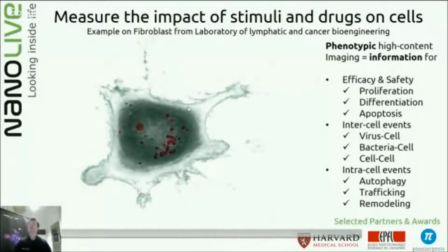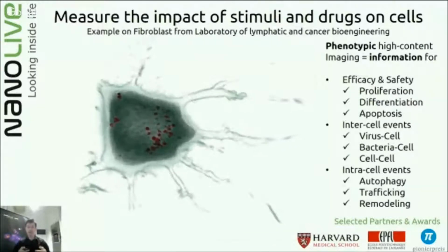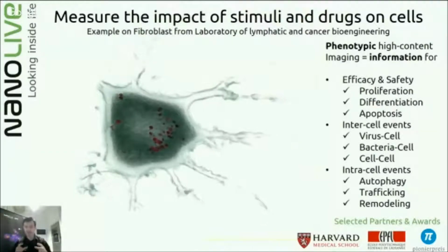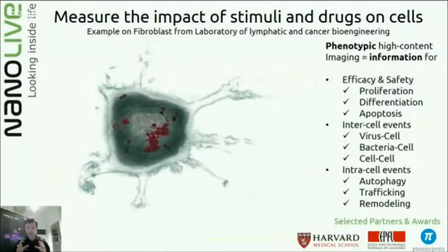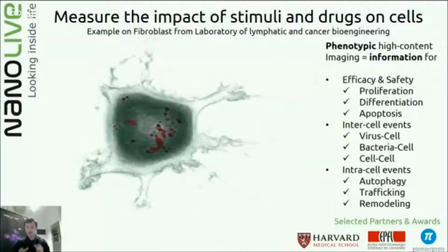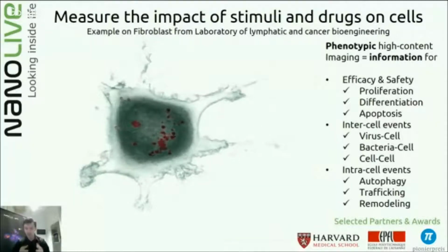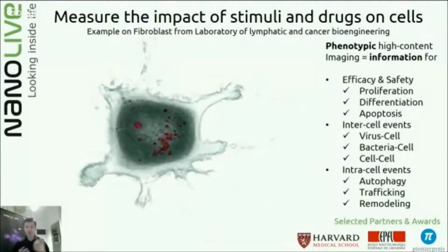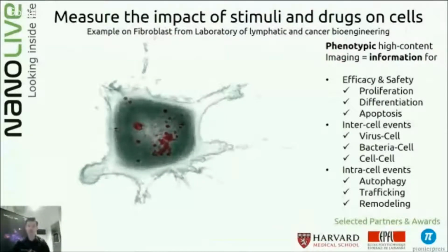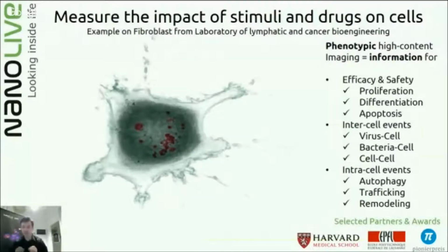And please note that the colors that you see in this video have been added after the video was taken, thanks to a process called digital staining. I will explain in detail how this process works, but bear in mind that we can change those colors every time we want, and we can do it in 5 minutes, or half an hour if you want to be extremely picky.